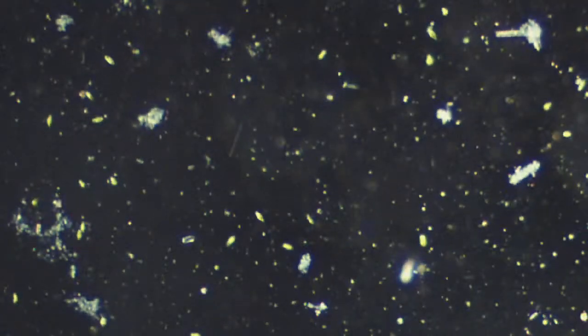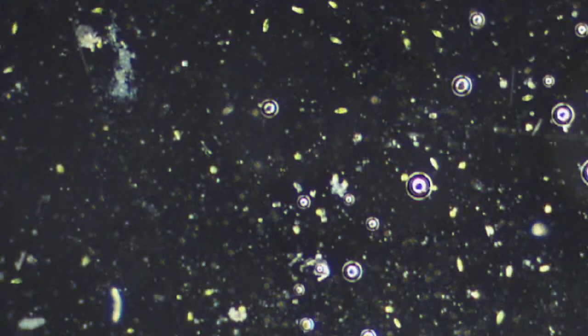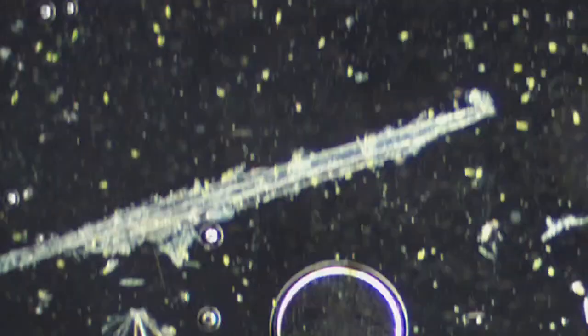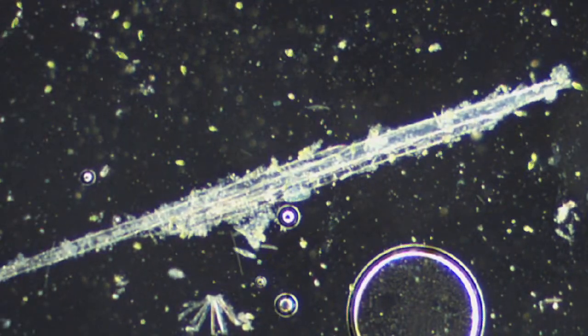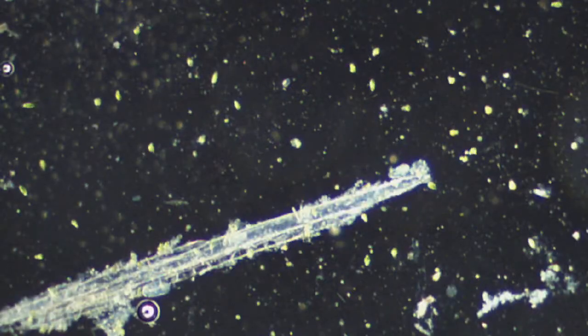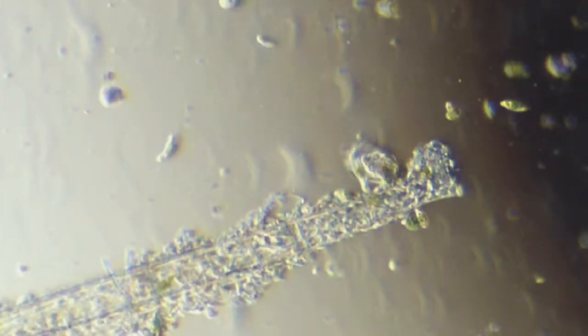Oh boy, here we are again. Super crazy. This is a very, very rich pool that I got this from. Look at all those guys. Euglena and chlorella and all kinds of stuff in there. Oh, nice. I see a nice ciliate right there. We're going in. Yes. Look at that guy right in the end there.